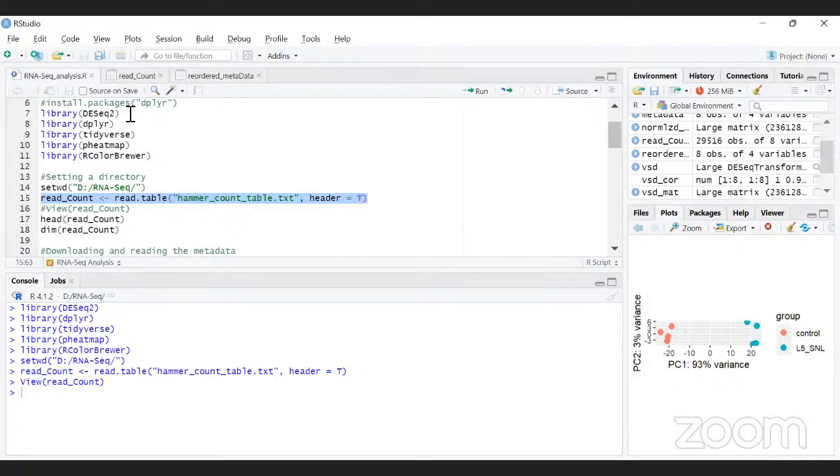It is like a library for differential expression analysis, but it also has a lot of other basic functions for exploratory data analysis. So I didn't want to write a lot of functions. I just wanted to introduce you to functions that are already available. DESeq has a few functions that we can actually use for exploratory data analysis.